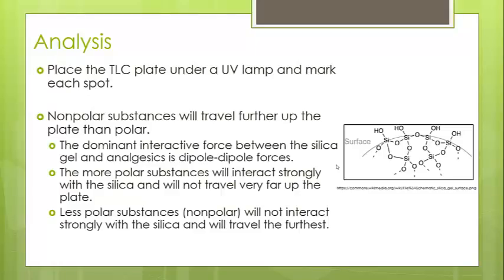Looking at the migration of your spots on the TLC plate, we will see that nonpolar substances will travel further up the plate than polar substances. Your dominant interactive force between the silica gel and the analgesic is a dipole-dipole force. So the more polar substances interact more strongly with the silica, and they will not travel very far up the plate. Your nonpolar substances will not interact strongly, and you will see that they've traveled the furthest. So this is your structure for the silica gel. You can see that polar substances will interact more strongly with this than nonpolar substances.